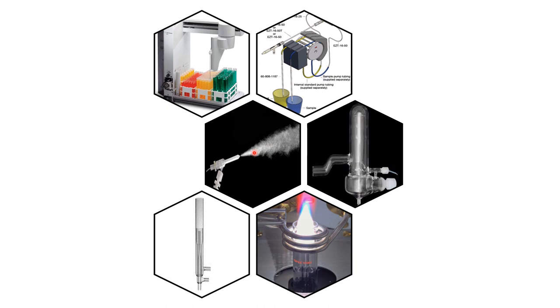We have a high flow of an inert gas that sprays over the top of a tube that contains our sample, and that causes it to be broken up into lots of droplets. Quite often there are too many droplets to introduce into the plasma, because if you spray lots of water into this thing, it tends to blow it out. So what we do is remove the largest droplets in a device like this, a spray chamber, where the large droplets hit the side of this glass and get drained away. So we end up introducing a very fine aerosol into our sample.